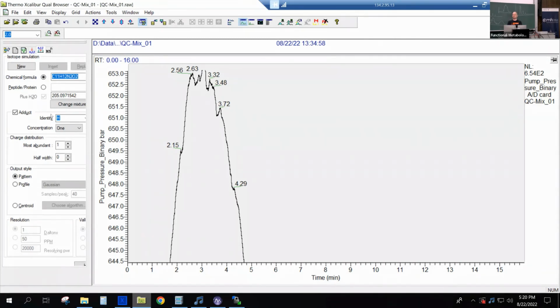For that reason, do you run any pre-screen studies before you run a full study, to check for contamination? Yeah. If people contact you before they have all the samples, then yes. But sometimes it's just, oh, Daniel, I have 200 samples. Can we analyze them? And I say, oh, okay. But then it's good if they either bring their own column or if there's a pre-column. Ideally one is involved in the planning, right? And ideally it's not only me, but also a statistician who does some power calculation, but I think that's unfortunately not the norm. It's a more rare situation.